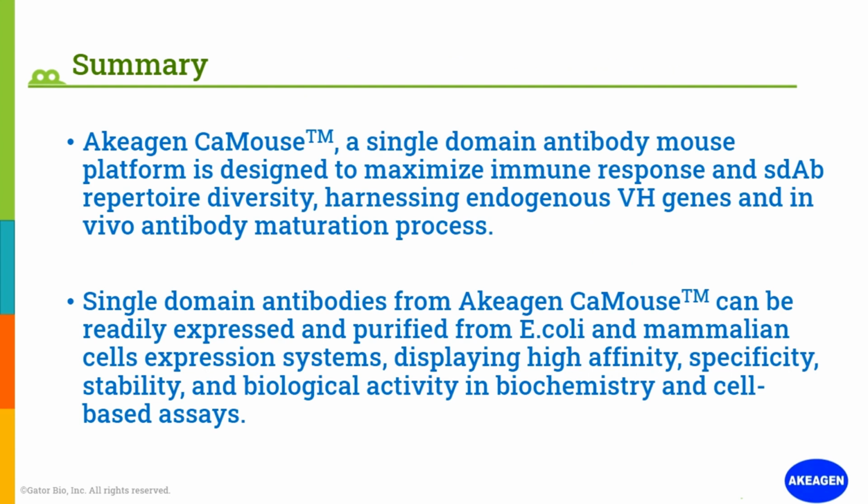So in summary, we developed a mouse single domain antibody platform that can generate single domain antibodies with high diversity and high affinity, and with phage display, we can quickly prepare samples for binding activities.